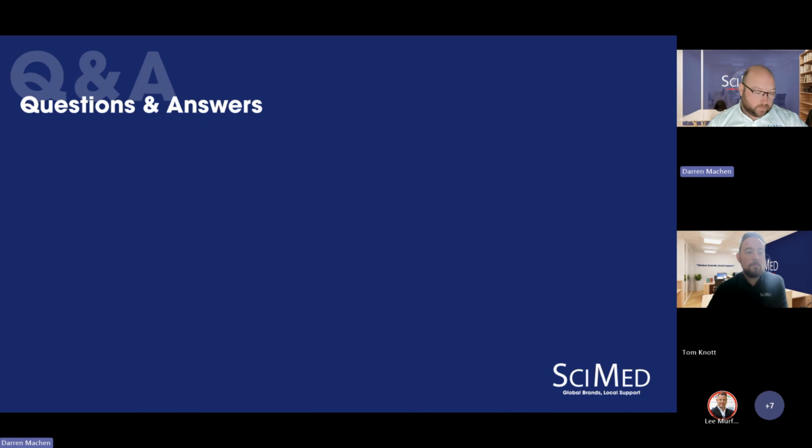Definitely seeing that as well. What about the interpretation of the NIR data? I think you may have already answered. This is a question from me actually, in terms of not being an expert myself in AIs. What are the main barriers or challenges in terms of interpreting NIR data? If you're not an expert, you can't understand it, or is that always a hurdle? If I go into a new company, I think they understand that NIR can bring a lot to the game, but it's being able to pick those applications which are easily understood by all.